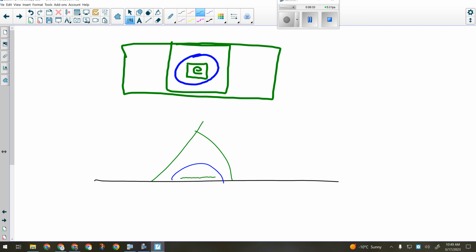And the letter E, you're only going to look at on the scanning power lens. So all of our microscopes, whether they're the new ones, the smaller versions, or the old ones, the bigger ones, have the same lenses, same magnifications. The scanning power lens magnifies a total of 40 times. So we're going to look at our letter E through the scanning power lens. If you go any higher than that, you won't see all of it because it's so big. All right, everyone with me there?